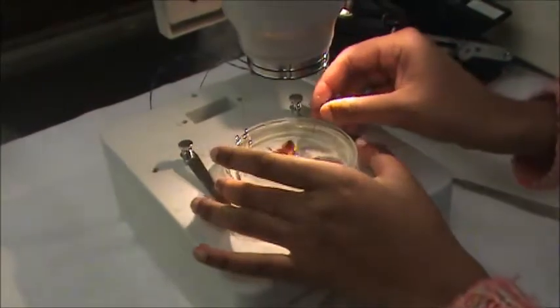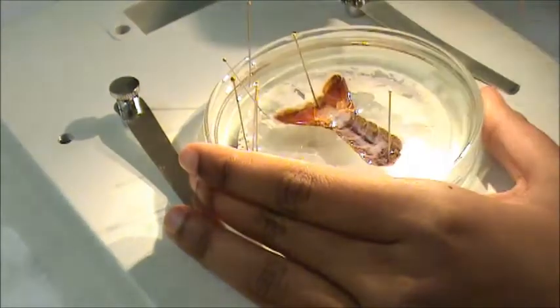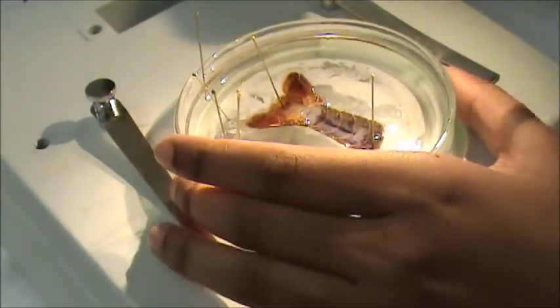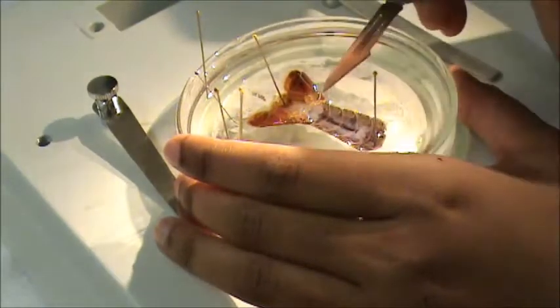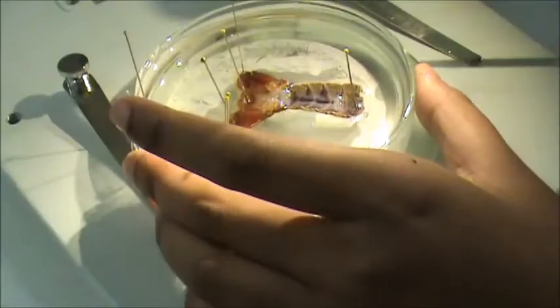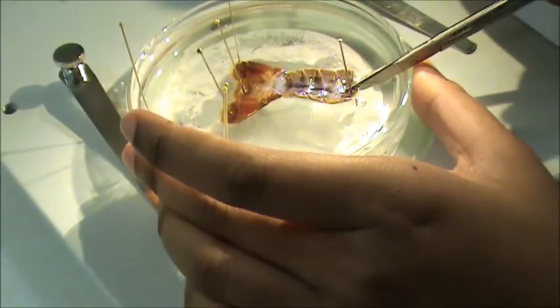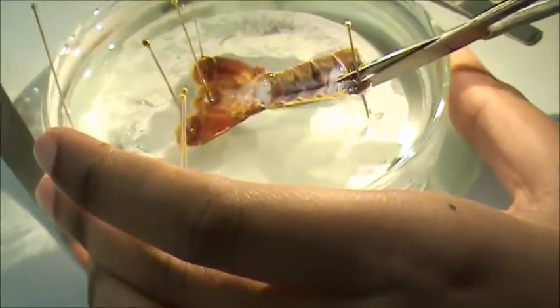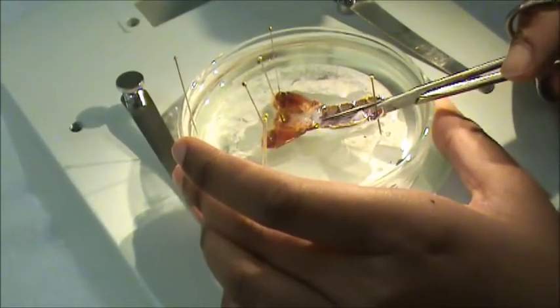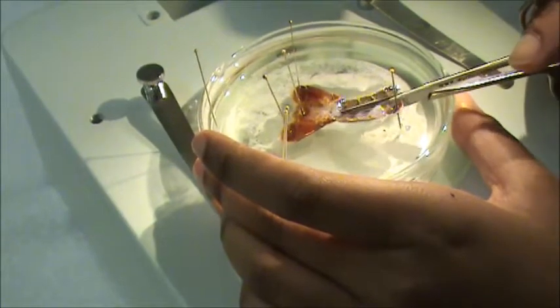So what we're going to do first is pin it down along the midline, and now we are going to come in with the scalpel and cut this part right there. So now I'm cutting the midline. Once I reach the end here, we can separate these two parts right here.